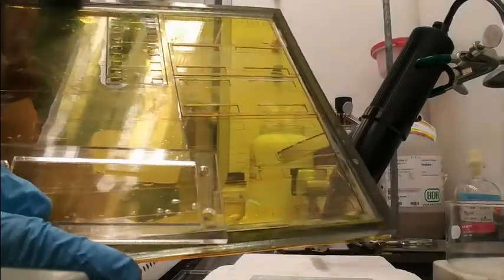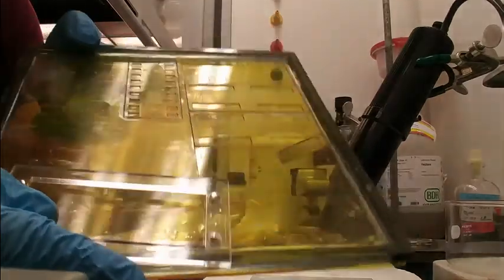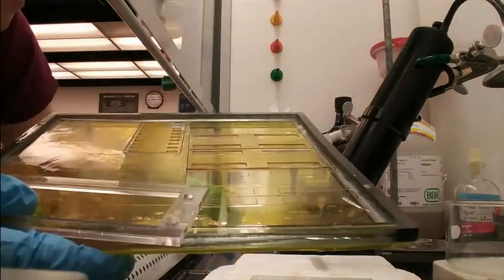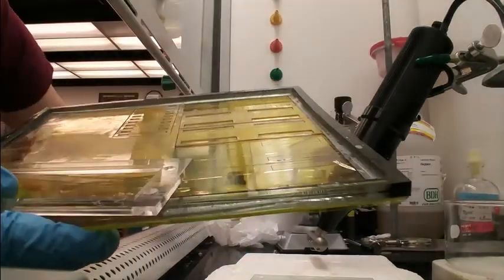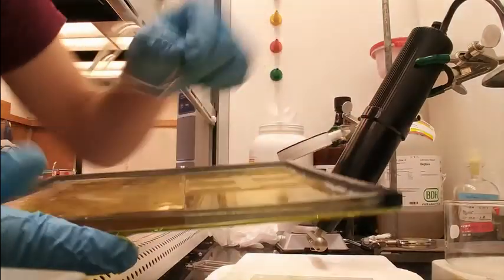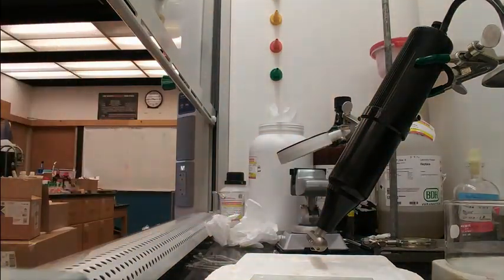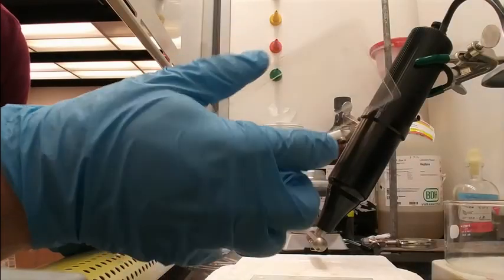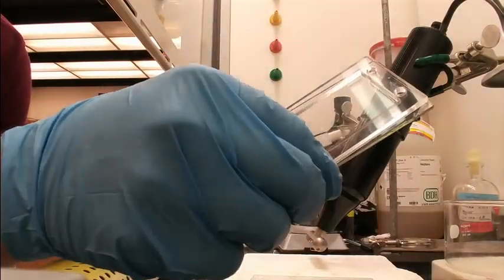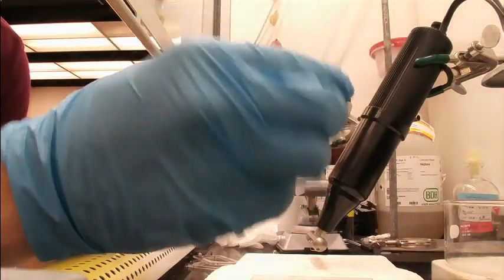Next, we take our pre-cut PDMS and remove it from the Kapton tape side. We will place it on a glass microscope slide with our plastic aligner, which is the exact same size as the PDMS chunk we cut. We want to flip it so that the Kapton side is now facing up on the large glass microscope slide. We will then center it on the slide using a plastic PDMS aligner, as shown.